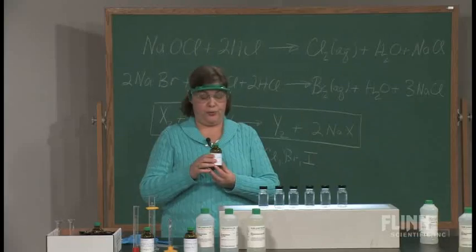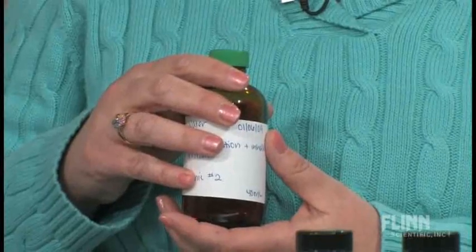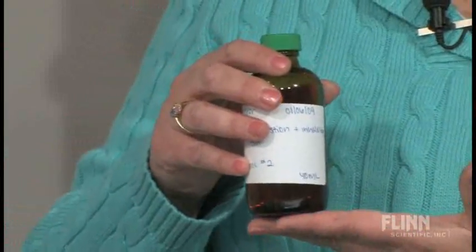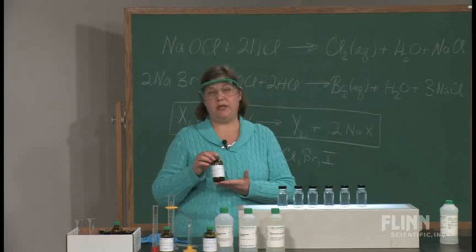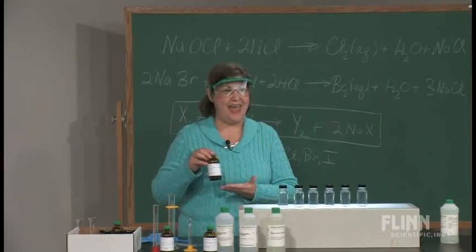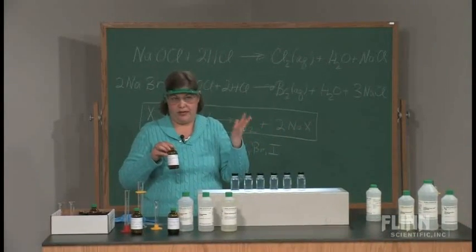What you want to make sure that you do is that you put it in a glass bottle, preferably, and actually what we definitely recommend is a PVC-coated glass bottle. An amber bottle will protect it from light, and that's very important. Even if you're going to be using this within 2 to 3 days, it's extremely important to remember to label everything with the hazard warning and the name so that there's no doubt about what you have. The worst thing is to have a bunch of bottles in the hood with no labels on them.